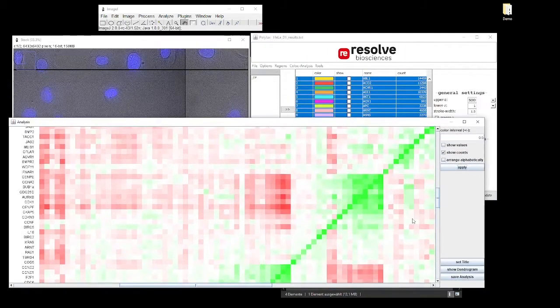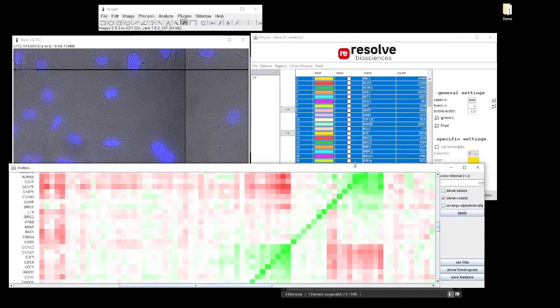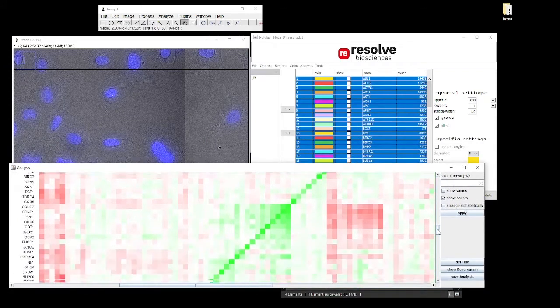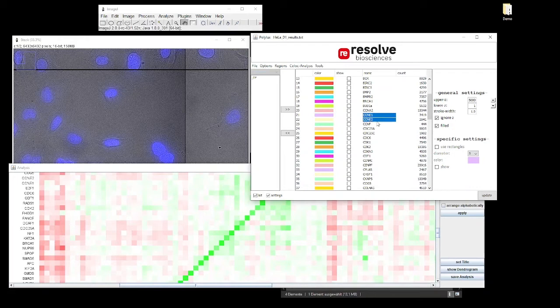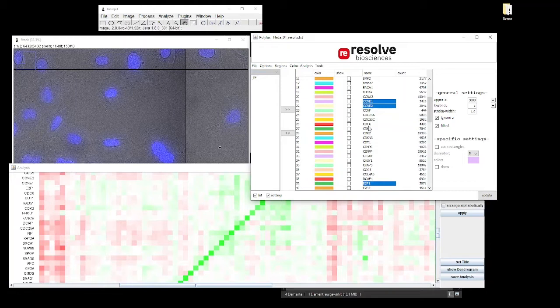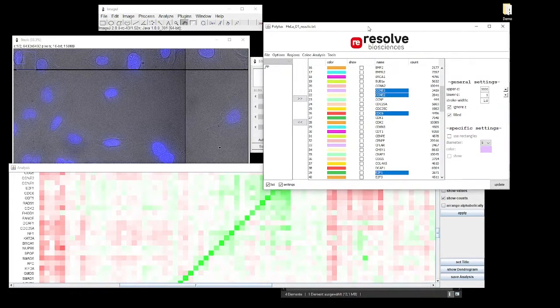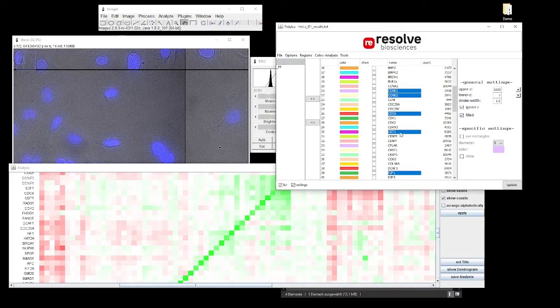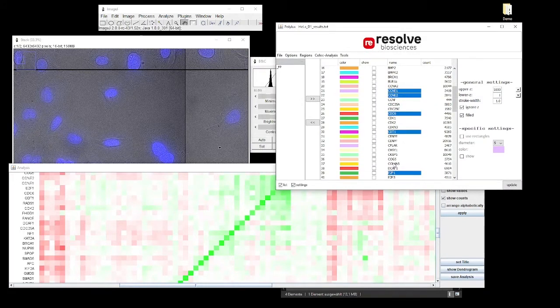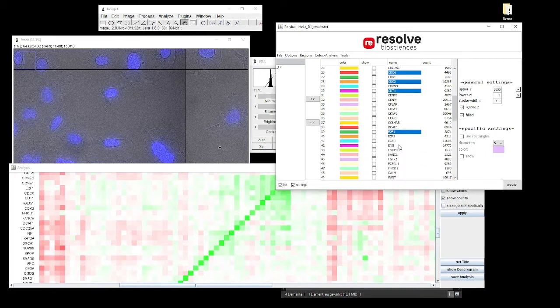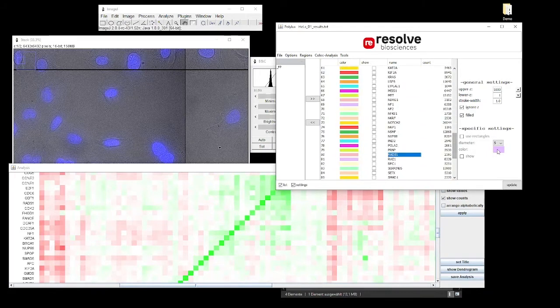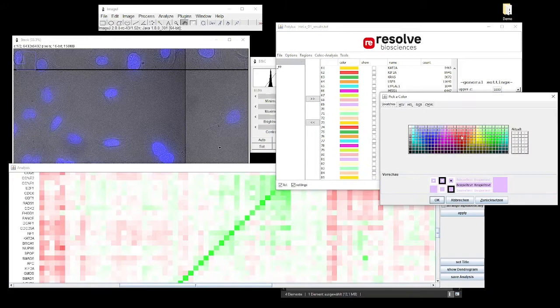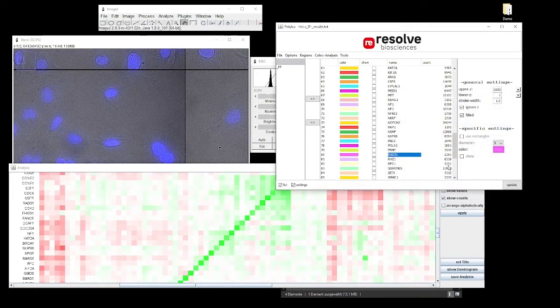Which is a bit surprising because the sample material we have used here is just HeLa cells, so it's one cell type and we don't expect cell type differences. But still we can see there are two clusters of genes that co-localize with each other but avoid the other cluster.